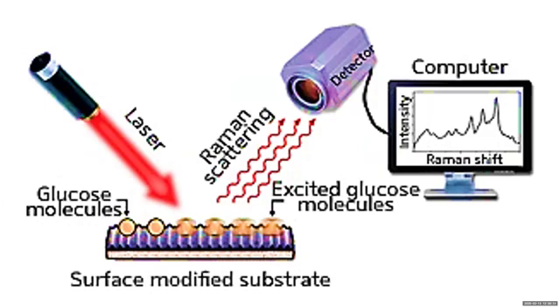So one mechanism is localized surface plasmon resonance, which is electromagnetic enhancement. Another component is chemical enhancement, or the charge transfer mechanism. Because nanoparticles increase surface area, there are more molecules which can adhere to the surface, so the signal improves.